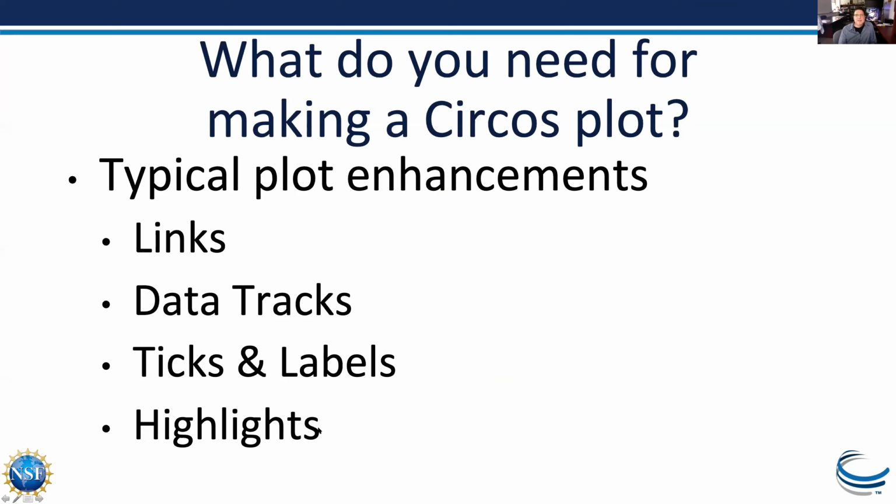And we saw it all illustrated in that previous example. So that's kind of what you're working for. And that's actually the best way of making a Circos plot. If you have something similar to what you want to make using your data, it's best to start with the code example of that if you can find it. And I give some tips in the expanded version of this, in that link, about where you can find some of this.